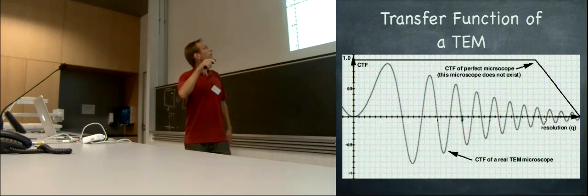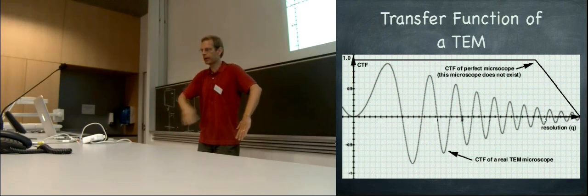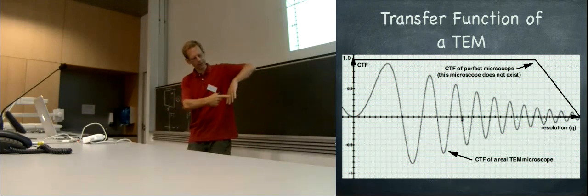Yeah? And then the contrast is positive. That means you would have a picture that shows a belly and two arms, and then everything is okay. And then I have 5 fingers here, and these 5 fingers are closer together. That's a high frequency detail.